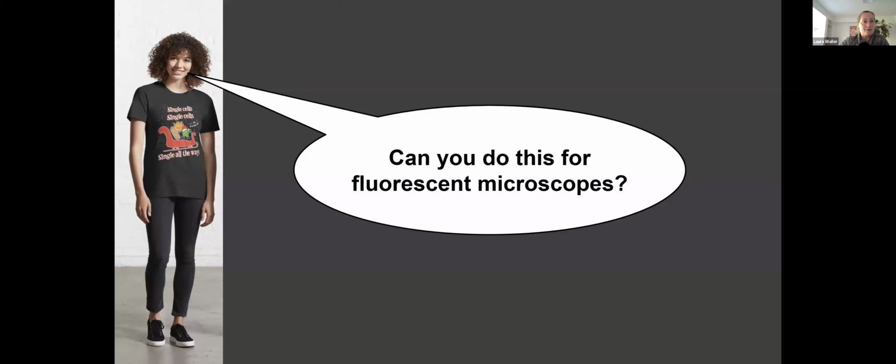Okay, so I still have 10 minutes, and I want to get into what I always get from biologists, which is, oh, that's nice, but I don't do label-free methods. I always use fluorescence. I want to do functional stuff. And fair enough. Quantitative phase is becoming more and more popular because it's having more and more capabilities, but it's still fundamentally structural information about your sample. Fluorescence is where you're going to get functional information, and so we want to look at both.